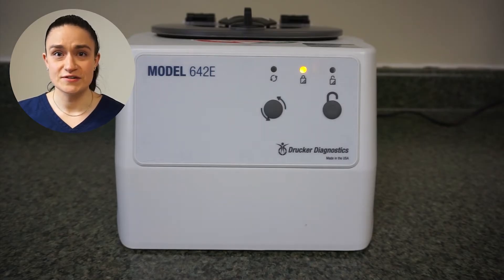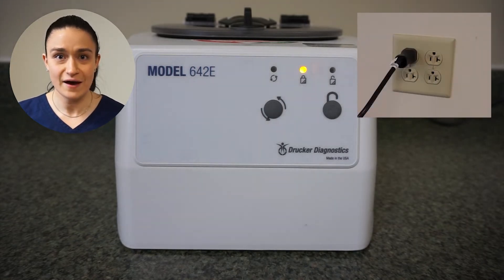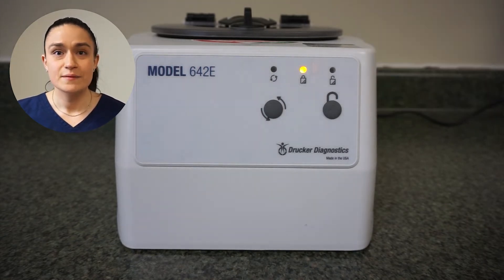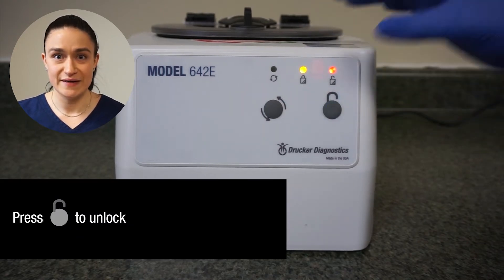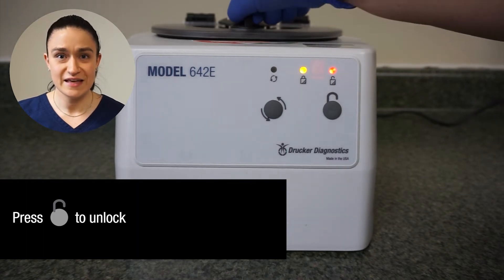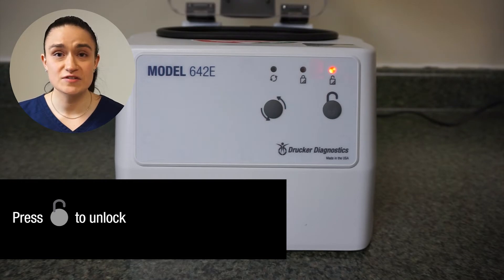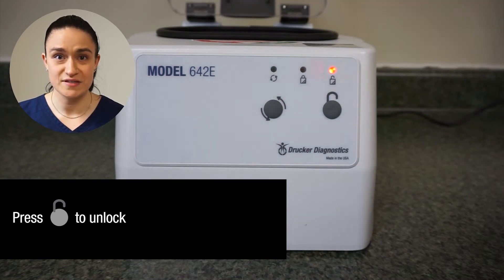Start by making sure that your 642e is plugged into the wall outlet and receiving power. Next, press the stop/unlock button to make sure that the lid is unlocked so you can open it by pressing down on that lid latch and turning it a quarter turn counterclockwise. Make sure that the lid remains open throughout this process.